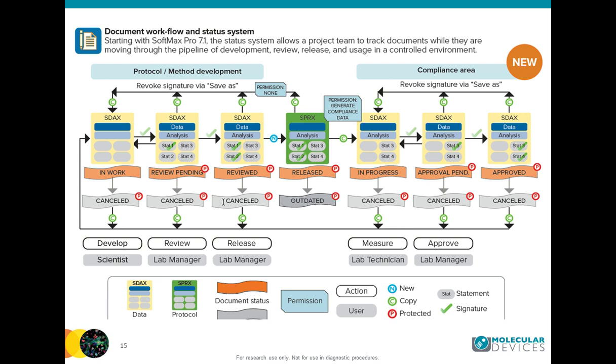And if you move from like 5.4 to version 7.1, we anyhow recommend revalidation because not only did we change the storage system from a Windows file-based system to an SQL database, but also there has been so much development in between that we recommend a revalidation for the protocols that are still in use.